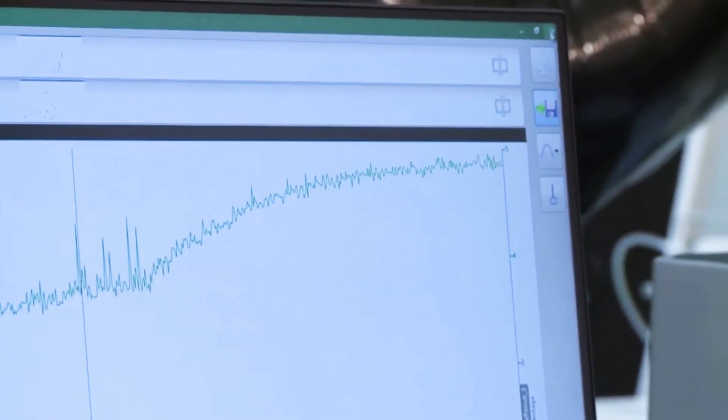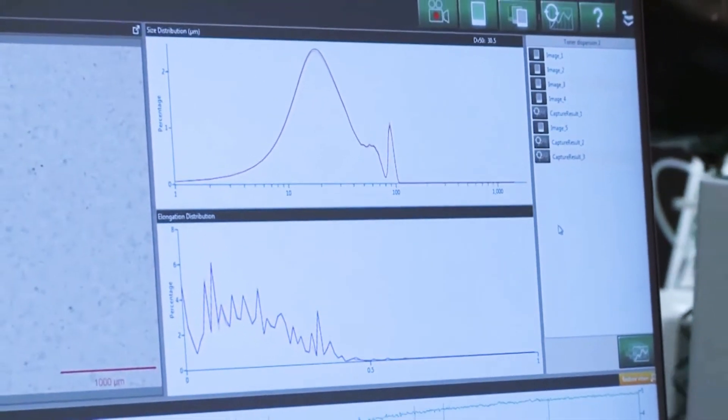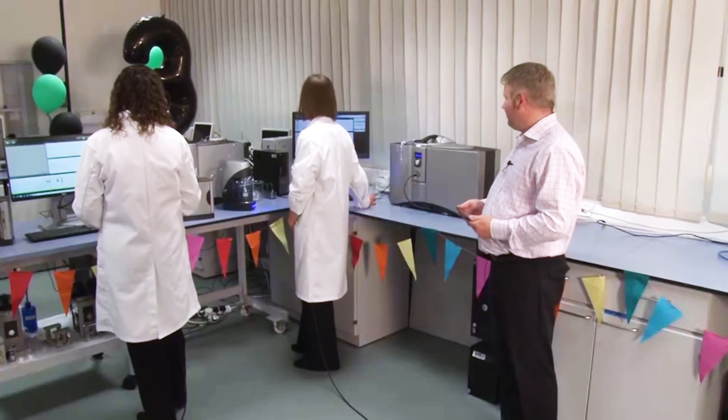I'll just have a look again at the live view. It's definitely starting to level out. So what's the master size telling us, Anne?